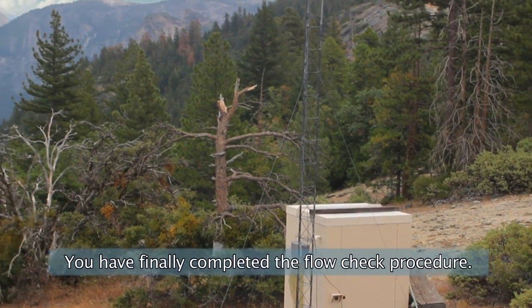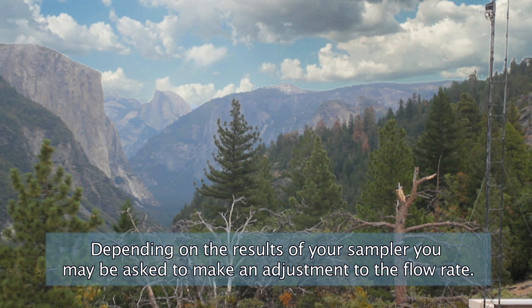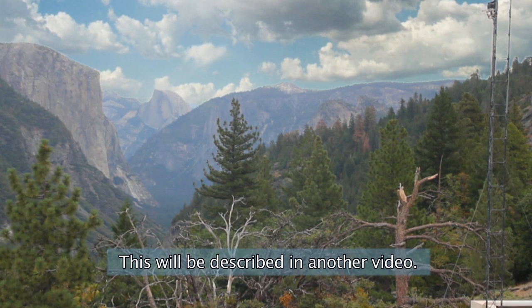You have now completed the flow check procedure. Depending on the results of your sampler, you may be asked to make an adjustment to the flow rate. This will be described in another video.